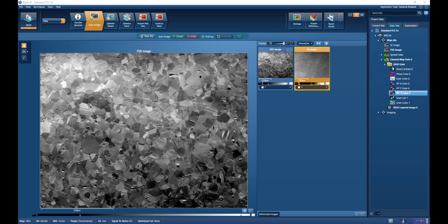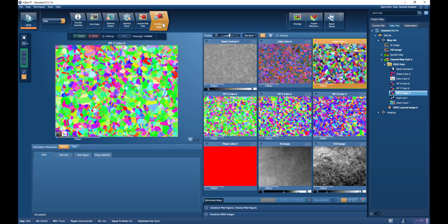For that, I would refer you to another video focusing on the selection of step size in EBSD measurements. So we've analyzed this particular sample, and we can look at the results of the analysis by switching to the construct map stage.